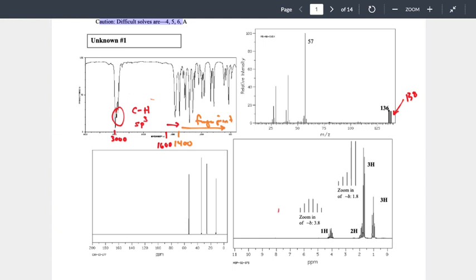So if bromine and chlorine aren't present, there's going to be an M plus 2? If there's no bromine or chlorine, there will not be an M plus 2 with an intensity that matches either of those. Because you can see some that have very small M plus 2s. And what you're looking at there is a stacking effect for other isotopes. Being very small percentages, they do show up. They just show up in a case that's not easy enough for us to measure. It's small enough that you just ignore it? Yes. For the record, because we're talking about small enough, we just ignore it.